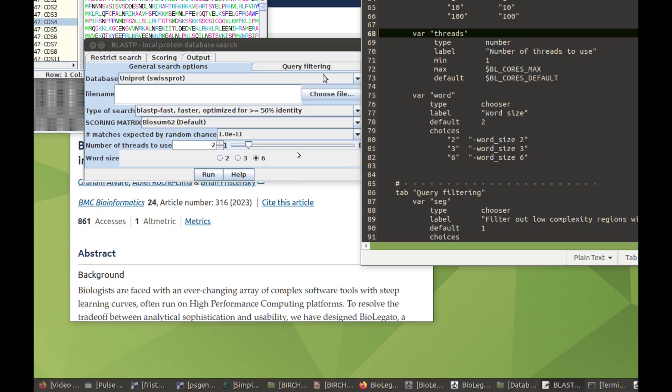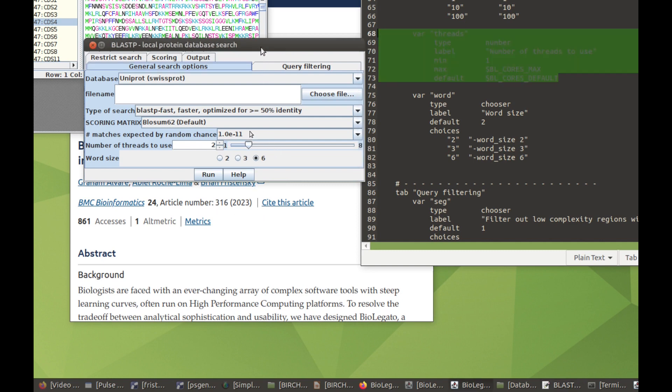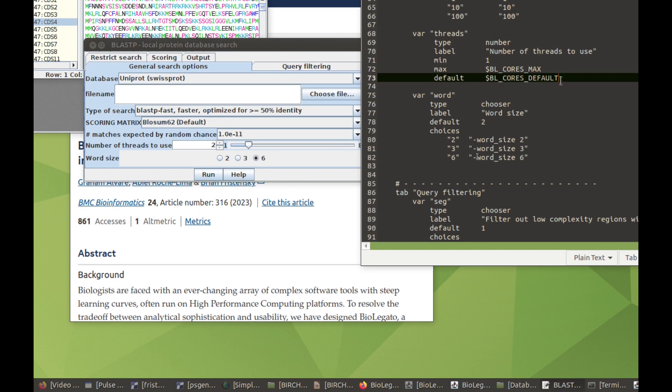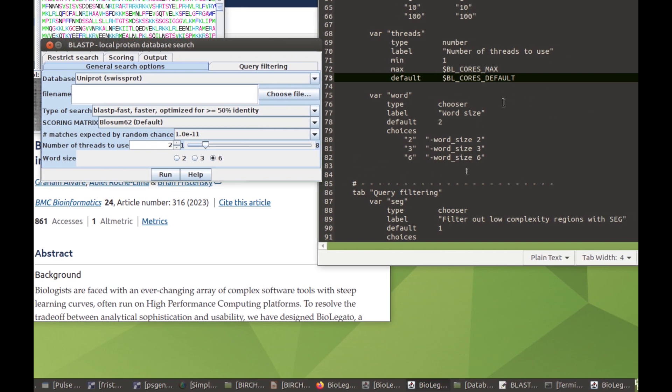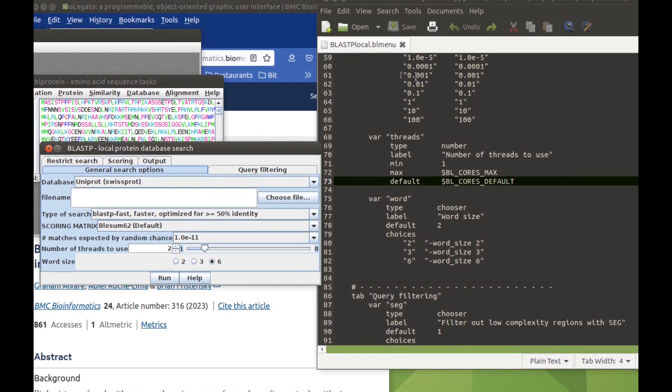Here is just a little bit of code for the PCD specification of this one line that says number of threads to use has a minimum value set as 1, a maximum value set to the maximum number of cores on the system, and a default value set to another environment variable, BLCoresDefault. The menu can be changed very easily. You can copy menu instructions like this and create your own BL menus for any new program you might want to add to BioLegato.